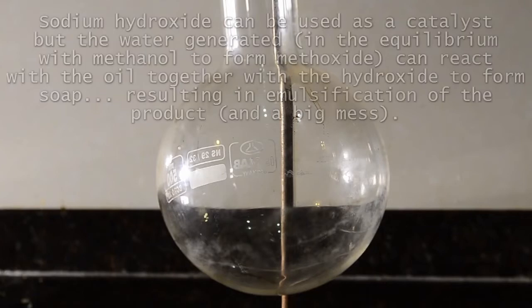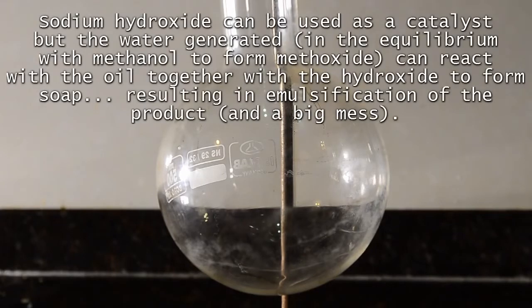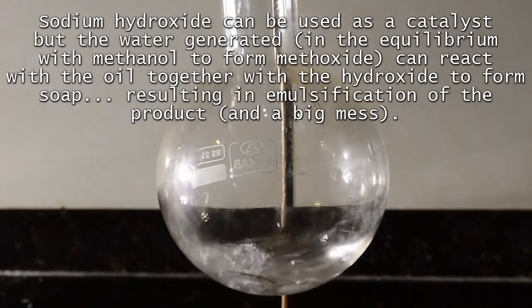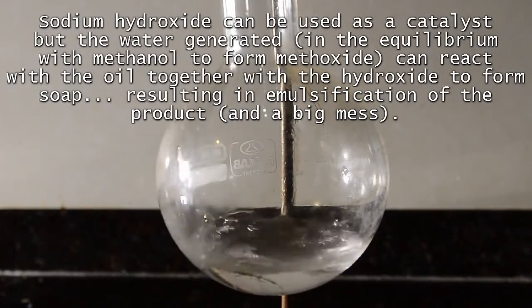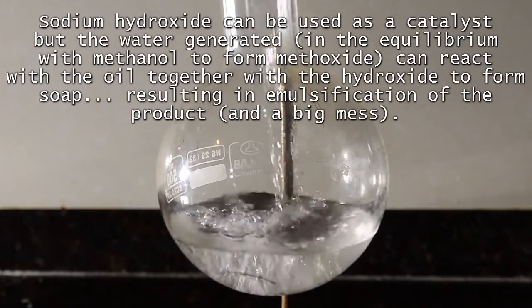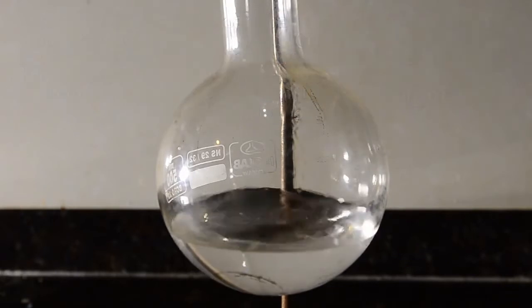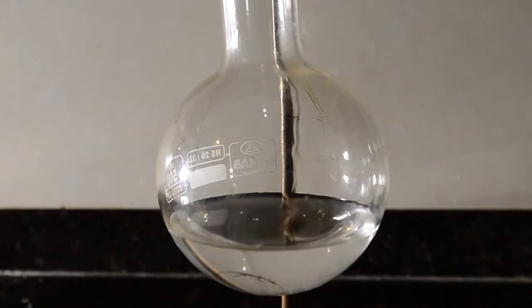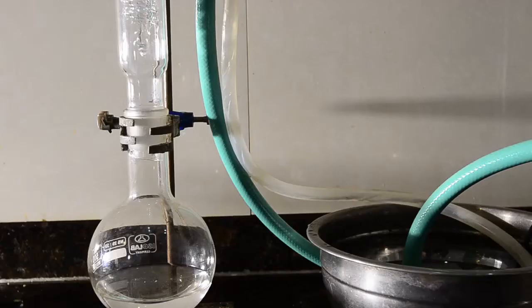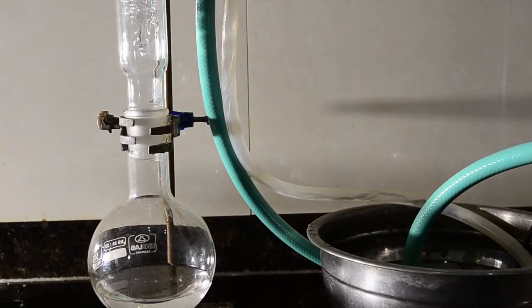Next we'll prepare our catalyst. Sodium hydroxide can be used but this has a problem of creating water in the reaction. The perfect catalyst is freshly prepared and dry sodium methoxide solution. So pour the methanol into a 500 ml flask and set it up with a reflux condenser running cold water.